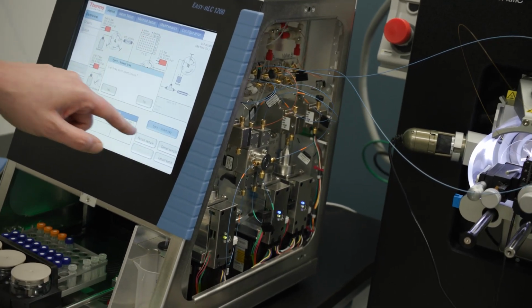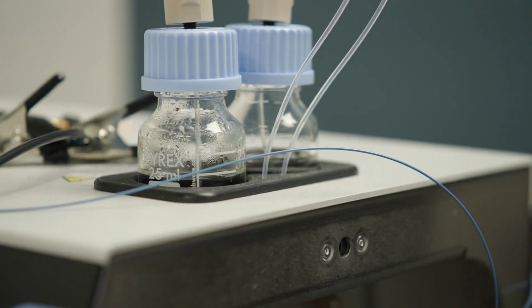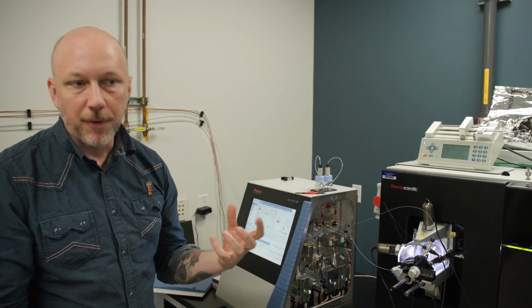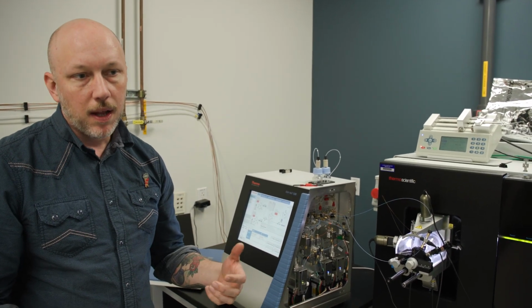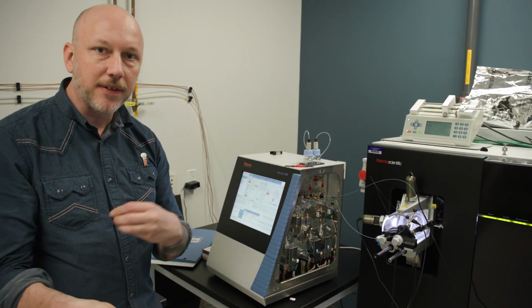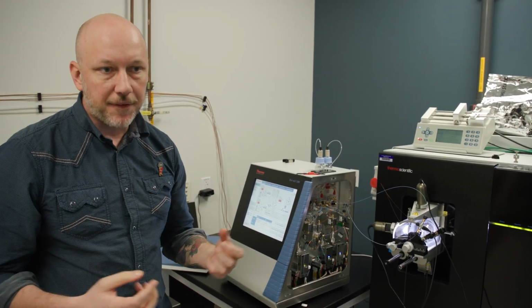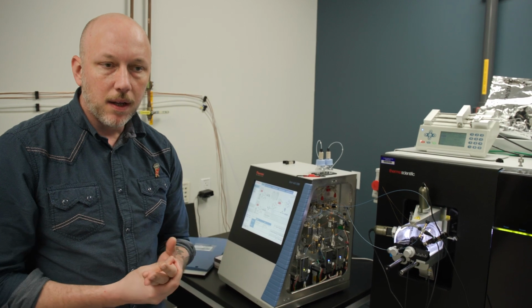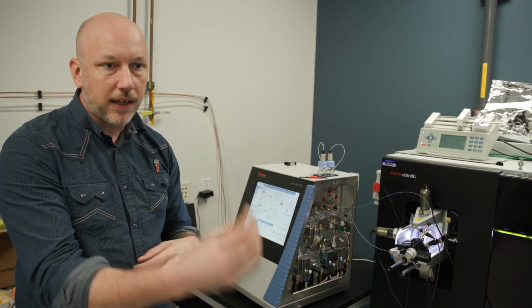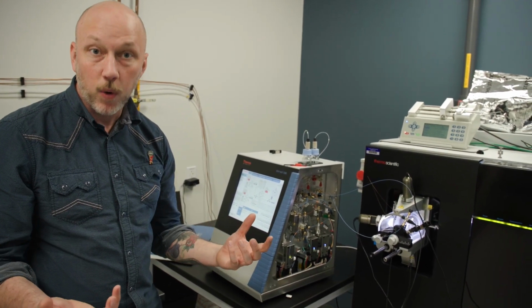One of the things that my lab is particularly good at is improving the sensitivity. That's somewhat to do with the mass spectrometry itself, but it's a lot more to do with the upfront sample preparation that we've made a lot of innovations for. And the reason that's really important is because if you're asking for a specific type of T cell from patient blood, or a certain type of T cell from mice, for example, right? Typically, the amount of protein material that we would need to analyze in classical experiments has been too high for most immunological questions.